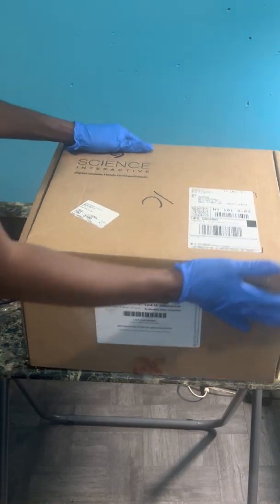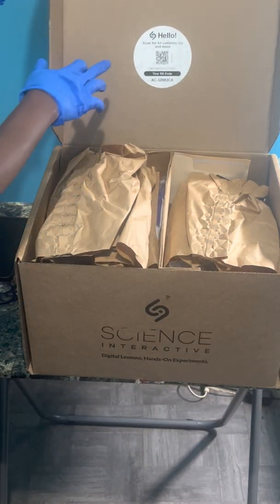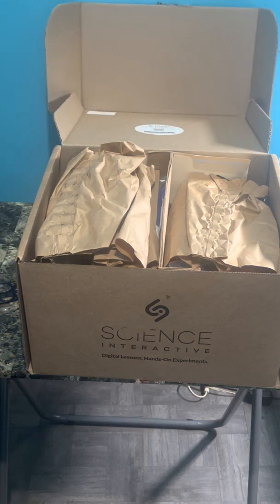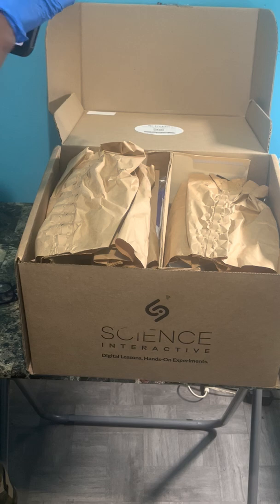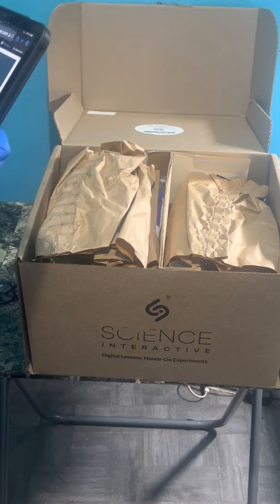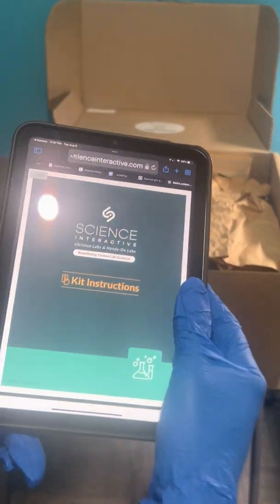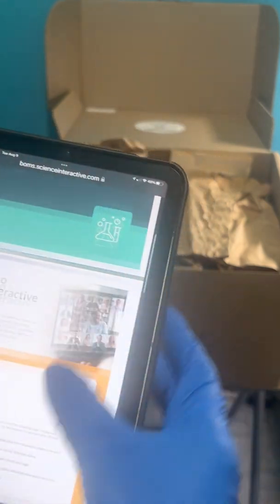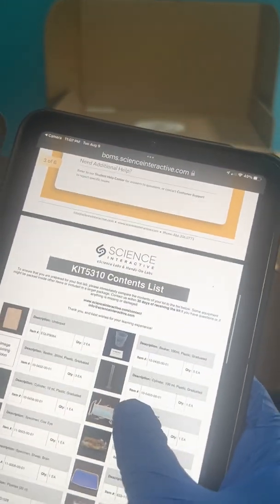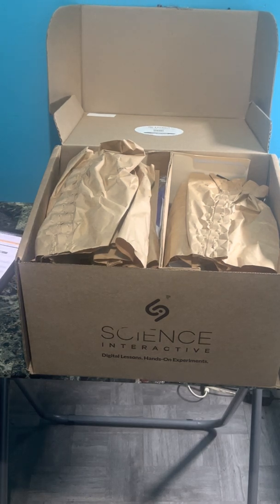Here we go, let's get right into it. I'm going to slide that open. The kit says 'Hello, scan kit for contactless' and it was inspected by Jay Stevenson — go J! Whoever J is, thanks for inspecting my kit, hopefully everything's there. It says to go to scienceinteractive.com. We have here a six-page guide — the welcome and all of that. Let's check the kit inventory. I'm going to put on my glasses.